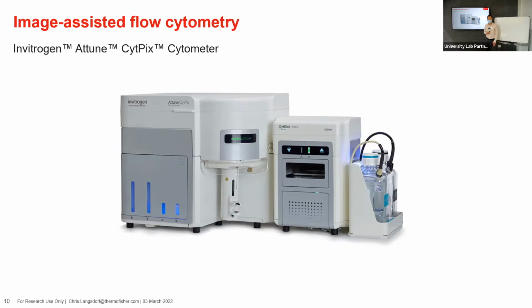And what is the probability of things not happening? You know, these numbers. What are some of the culprits? Oh, it depends on the sample you're running, and we can talk about that definitely. I'll talk about sample prep a bit and how we can get single cells and live cells, healthy cells for analysis. All these things help a lot.